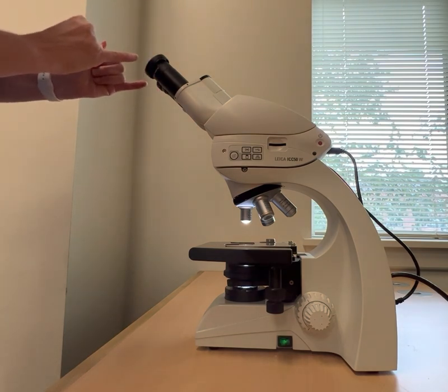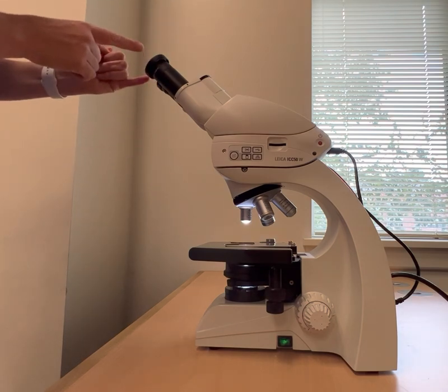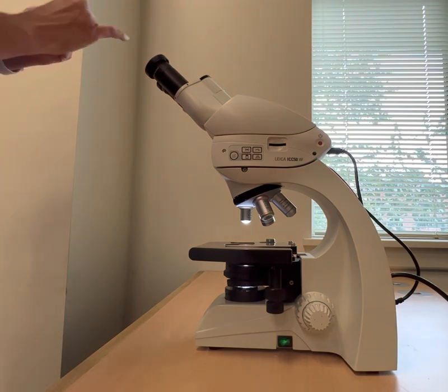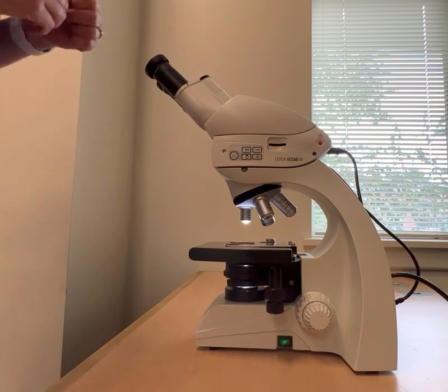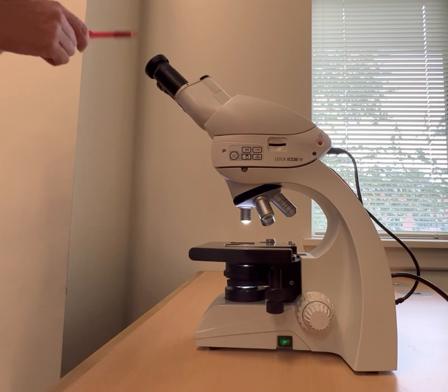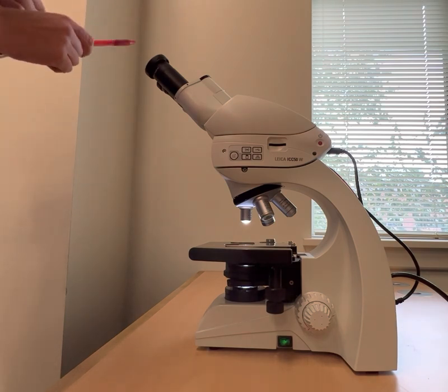So these are your oculars. When you look through these things and you look down below, they are going to magnify anything you look through them with 10 times the naked eye. And these things are going to be held on the body tube right here, which is what's going to hold the oculars. We have two of them, so this is a binocular microscope. Your microscope may have just one. It just depends, but this is our compound binocular light microscope.